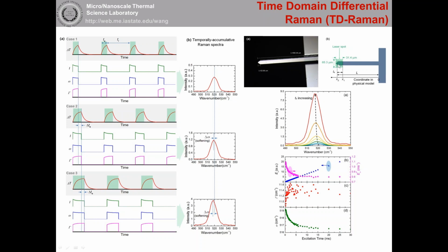It's a very thin one. We measure the top end. And so this one shows, if we change the heating time from a very short one to a very long one, how the Raman shift changes and how the intensity changes. All of it is related to the local temperature rise because nothing changed, only the heating time. Finally, we can determine the temperature rise.